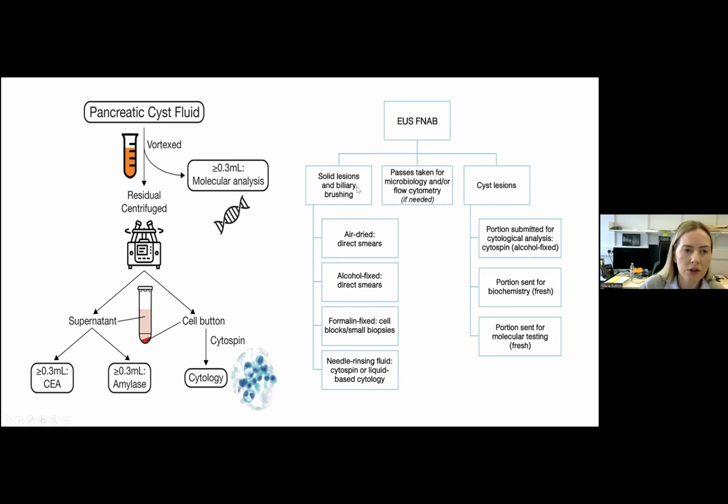With regards to solid lesions and biliary brushings, in terms of triaging of cases, at St. Thomas's, we have the privilege of being able to perform rapid on-site assessments. And what that allows us to do is mainly two things. The first one is to ensure that we have enough diagnostic material while the patient is having the procedure.